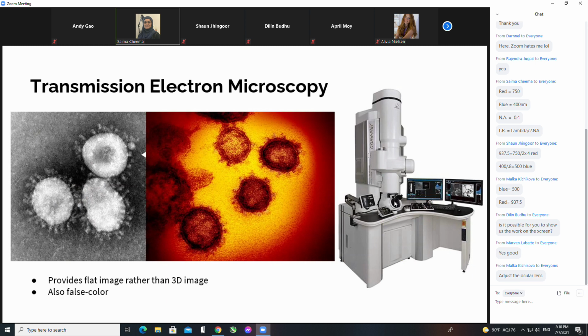Okay, so you might be looking at a lot of viral pictures as we go through this slide, and what we're going to see is detail. So viruses don't have a lot of detail. This is a very fine resolution image of a virus, and we're seeing spikes around it, and we're seeing the protein shell, and then there's something dense within that you could see is actually its genetic material.